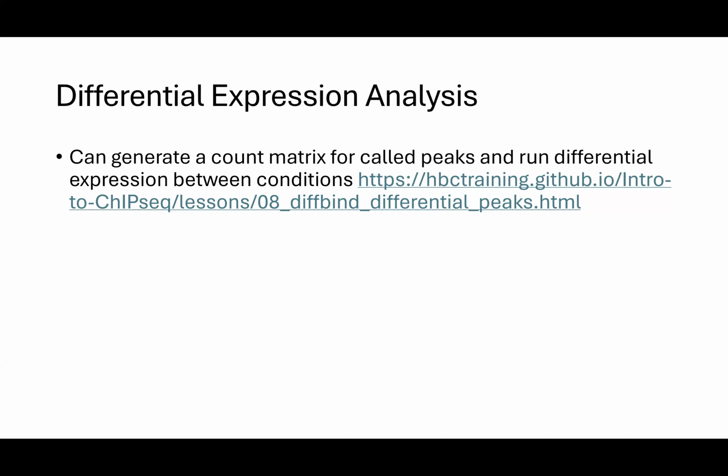And then you go back and say, well, how much did I detect at each of those regions? And then you can do differential expression, like we talked about last time, with whichever your favorite tool is. In that case, is that like for each peak you have a count? Yes. Yeah. And I put the link here for DiffBind.